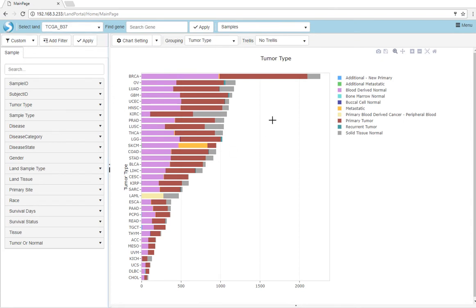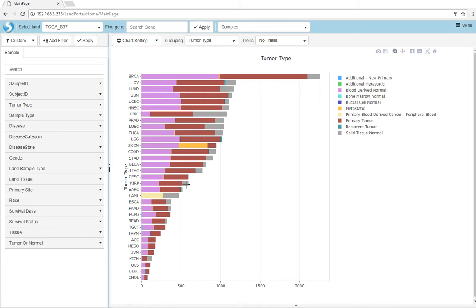Similar to the Lands viewed in Array Studio, sample distribution of a Land will be shown by default, with all samples in the Land grouped by tumor type and stacked bars with different colors to represent the sample types within the groups.